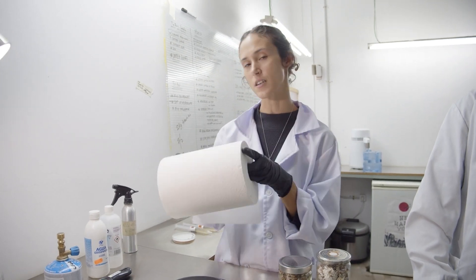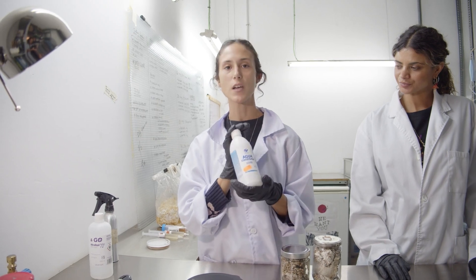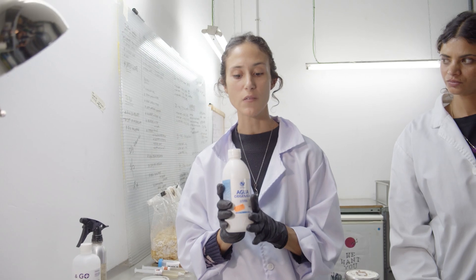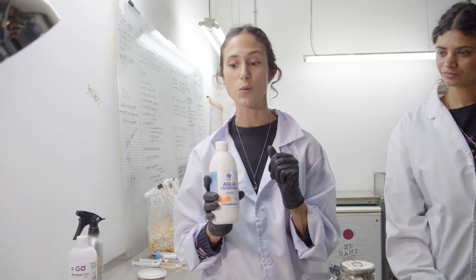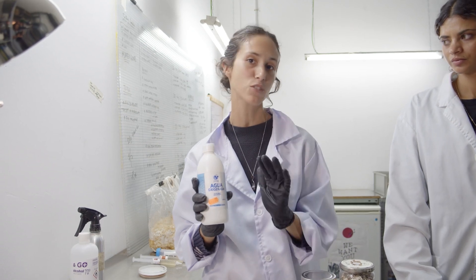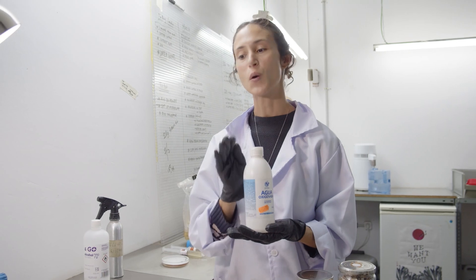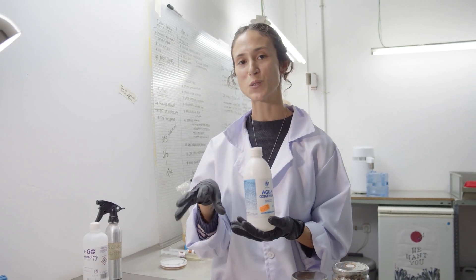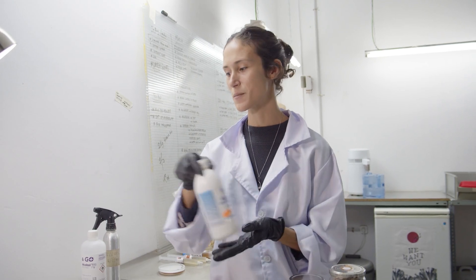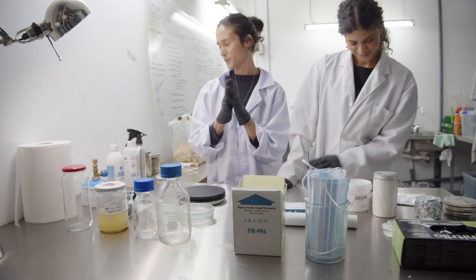We also use hydrogen peroxide in our sterile lab workflow, as it kills bacteria and molds. You can add it into your agar or wipe your surfaces clean to make extra sure that all microorganisms competing for the food source you want to give your mycelium are completely gone.